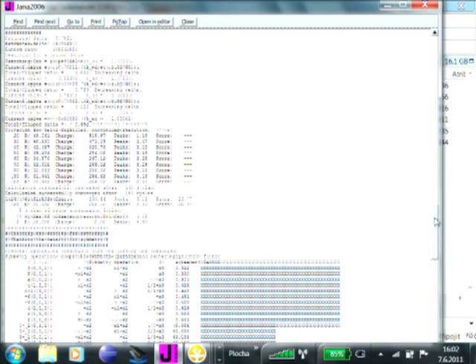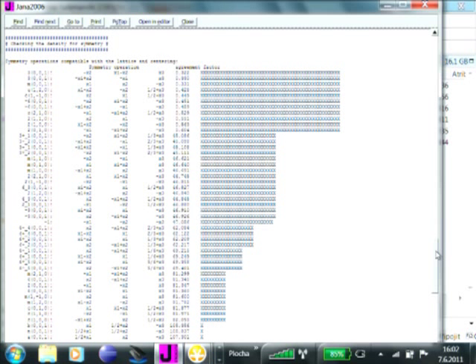And the next part deals with the symmetry. So here you see a label, checking the density for symmetry. And this long, funny list lists all possible symmetry operations that you can have in the lattice. In a hexagonal lattice, the list is very long. You can have threefold axis, mirror planes, C-glides, A-glides, screw axis, and so on. So the program takes all possible symmetry operations and calculates a sort of R value, a reliability value, of how well the symmetry operator is present in the density.